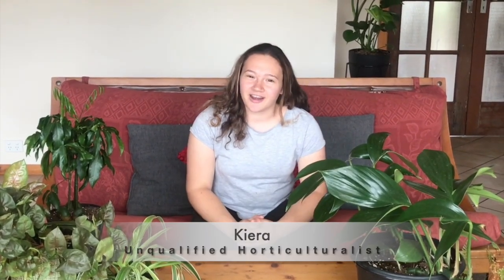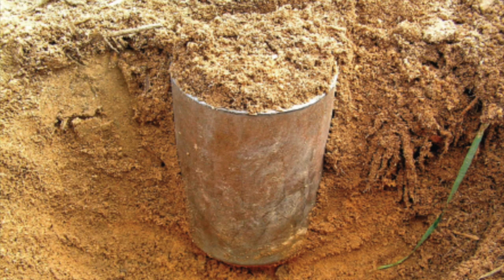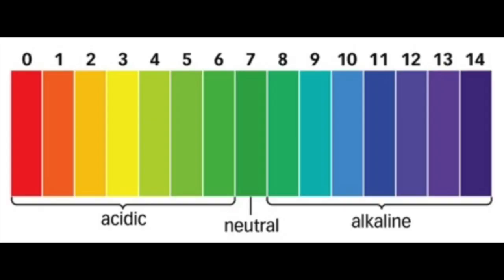Today we are going to look at soil testing in your garden. We're going to be doing two simple tests, a bulk density test and a pH test. Your bulk density test will indicate your soil compaction and moisture content. The pH test will show you how acidic or how alkaline your soil is. So let's get started and see what tools we need.